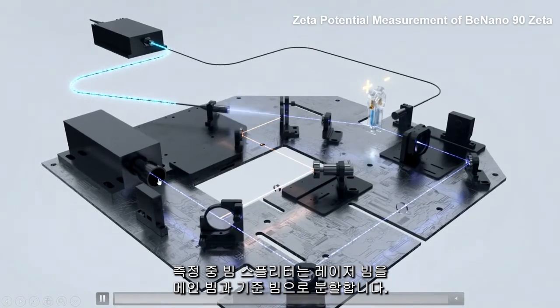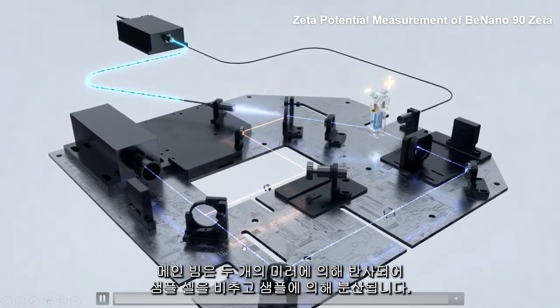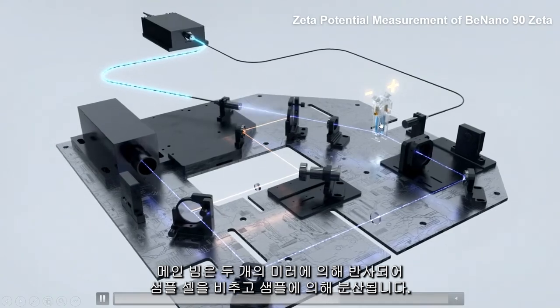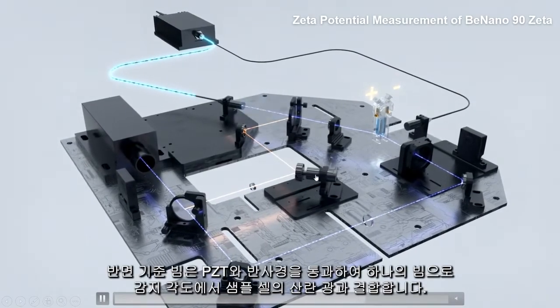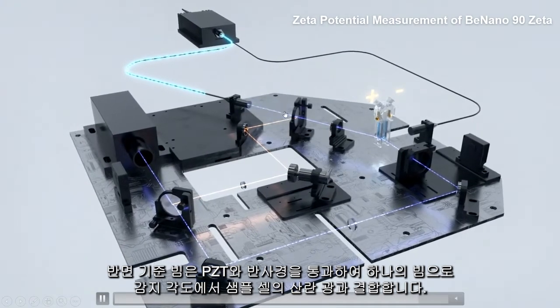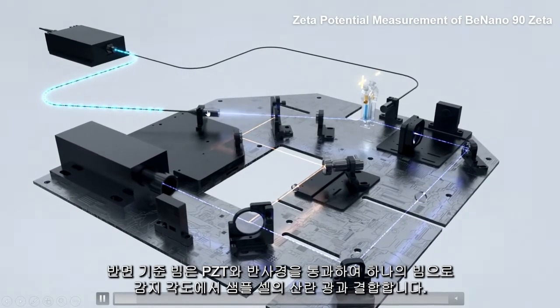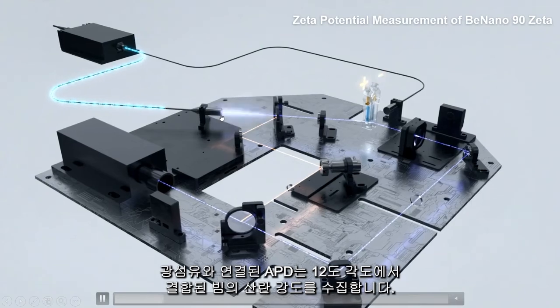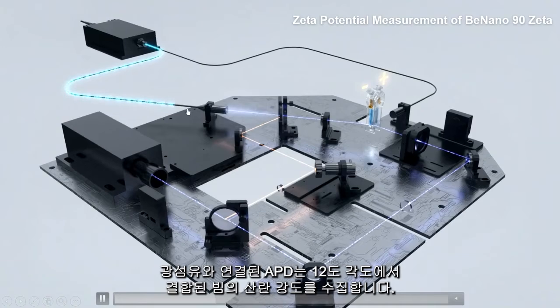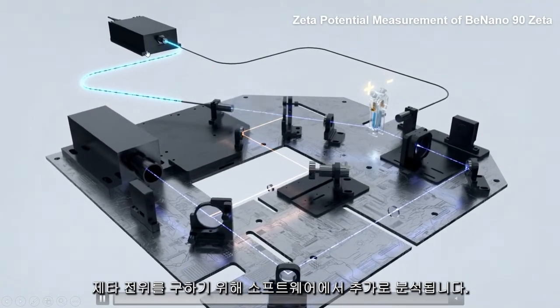In a measurement, the beam splitter splits the laser beam into the main beam and the reference beam. The main beam is then reflected by two mirrors, illuminates the sample cell, and is scattered by samples, while the reference beam passes through the PZT and the reflecting mirror and combines with the scattered light coming out of the sample cell at the detection angle as one beam. The APD connected with the optical fibers collects the scattering intensity of the combined beam at 12 degrees, which is further analyzed by the software to obtain the zeta potential.